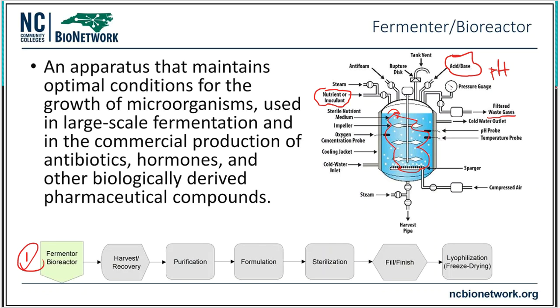Notice there's a little pH probe that goes in here that tells me what the pH is, so that way I can go up here and adjust the acid and base intake, depending on what we need. There's also a temperature probe here as well, so it constantly gives me the temperatures inside of the tank. That way, if it gets too cold or too hot, I can monitor that as well. Imagine a fish tank again. If that fish tank goes too cold or too hot, well, you're going to have some cooked fish at the end of this, or at least some dead fish if you're not very careful.